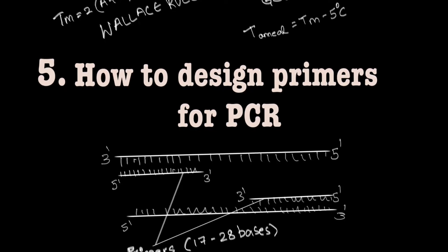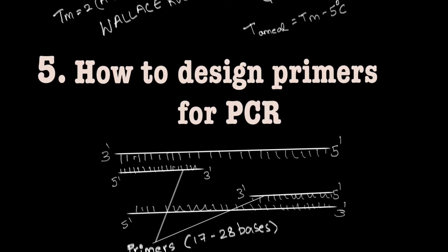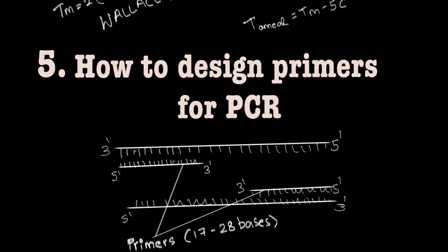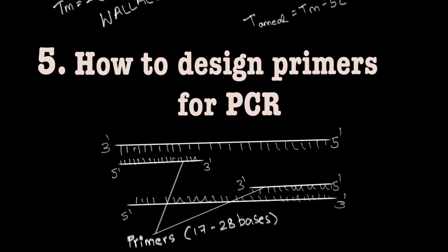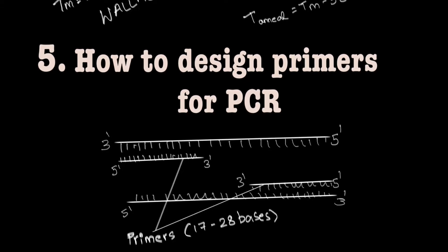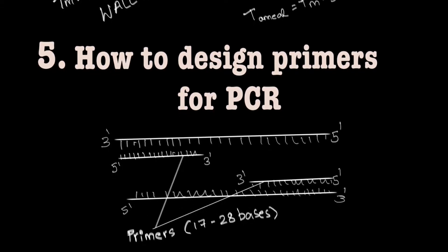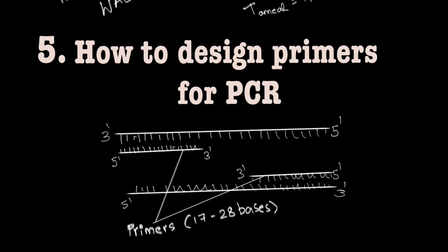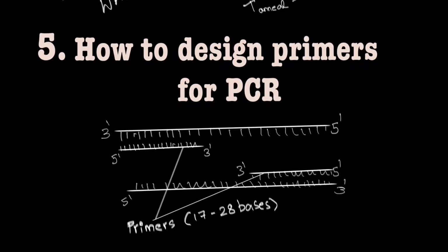So today we're going to use the Pick Primers tool from the NCBI website to obtain the primers for your sequence of interest of your desired gene. So let's begin today's video on how to design primers for PCR.